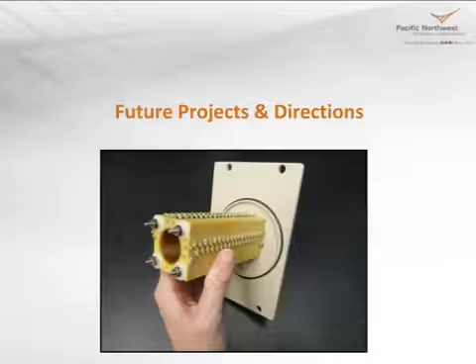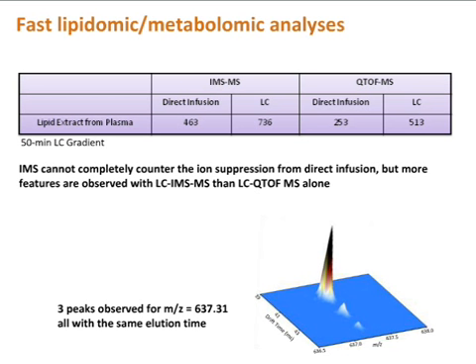So just to end my talk, I have a few slides on future project directions that we've been working on and areas that we think ion mobility is going to be very important. One area is analysis of lipidomic and metabolomic samples.